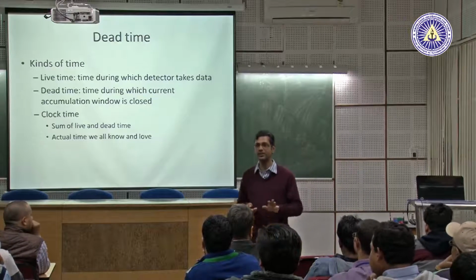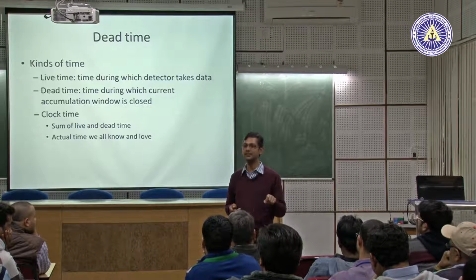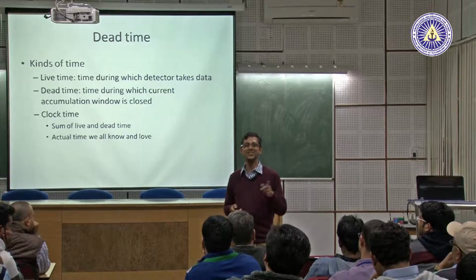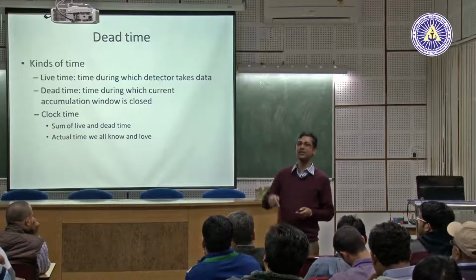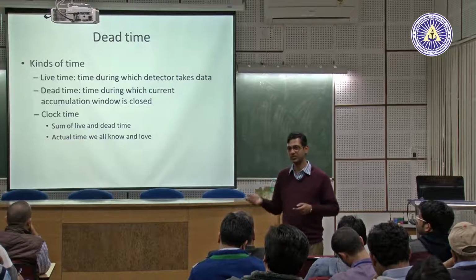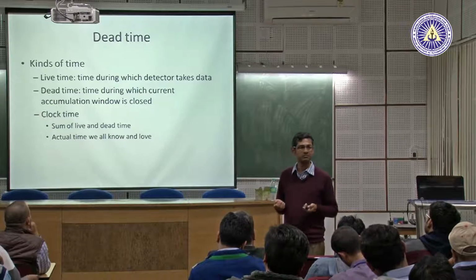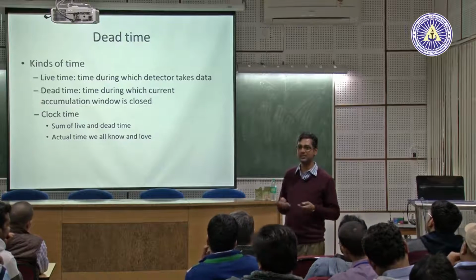Any idea how the detector works? No idea. These are called SiLi detectors, SiLi. They are not silly. Okay. What is it? Silicon lithium detectors. See what happens if X-ray falls on a SiLi detector. Lithium ion is a mobile ion. It moves because of energy transfer, and if it moves, it generates current. Then you can measure the current, and from there you can measure the intensity.